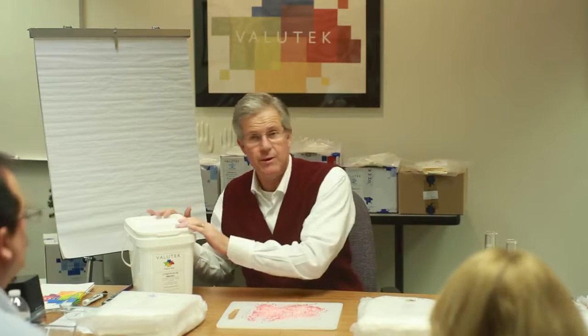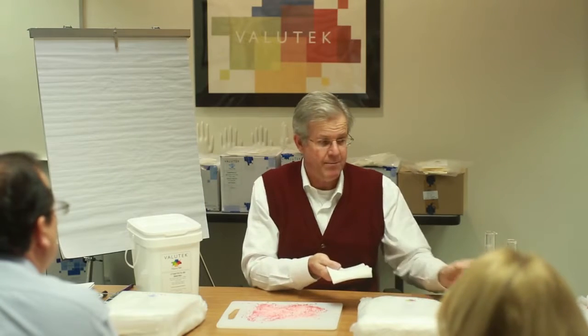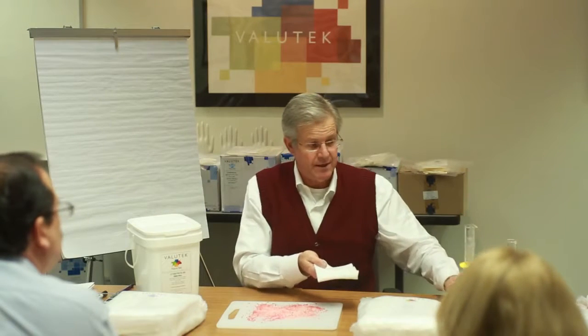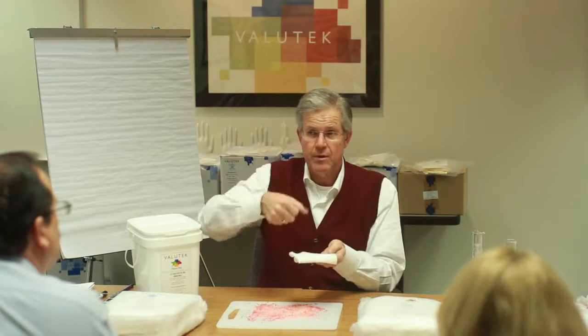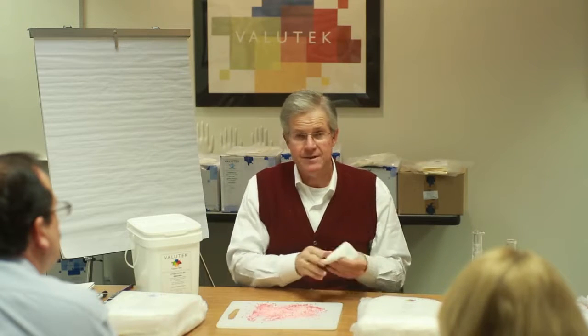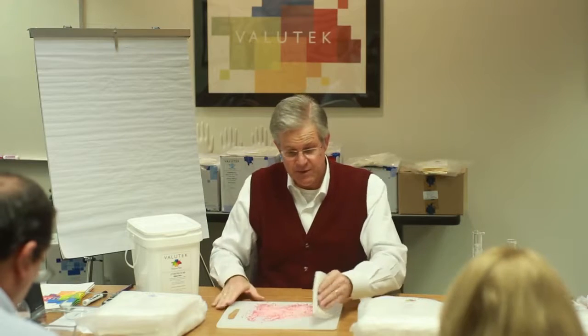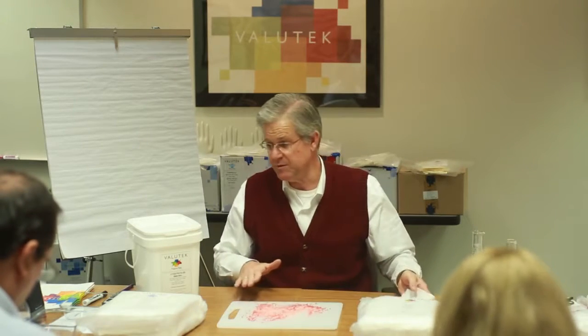So it's a little bit of a misnomer when we ask clients, are you using a dry wipe or are you using a pre-wetted wipe? Because if the customer isn't ordering a pre-wetted wipe, they're having to take the dry wipe, mix chemistry, and then with a squeeze bottle, pre-wet the wipe. Because dry wipes are used for one purpose, for spills. Outside of a liquid spill, there's no reason to use a dry wipe because as we've illustrated here, the dry wipe is only going to disperse or move the particles around.